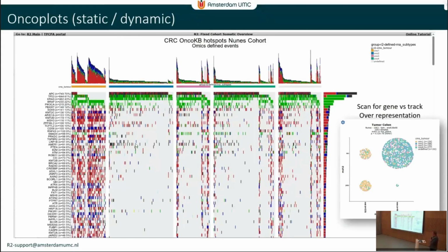Here, one of the things that you actually may have expected. So in colorectal cancer, you have this concept of microsatellite instability, which typically happens if particular repair genes are broken, are mutated. And one thing that you immediately pick up is that MSI status associates with MSH3, which is one of those repair genes that then is broken.